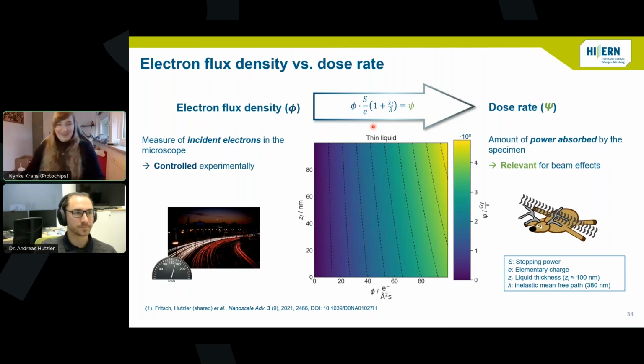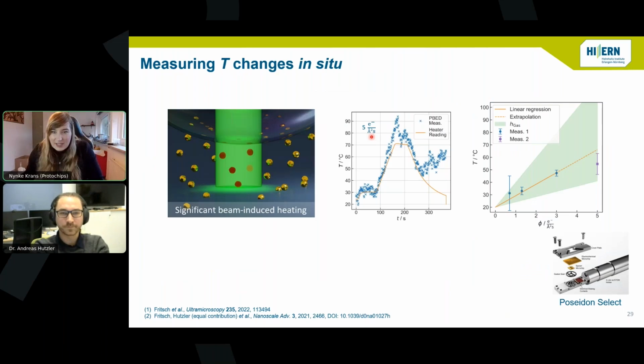That's very clear. Okay, thank you. Let me see, I'm going to grab a couple more. There's a couple of questions about the temperature studies that you've done as well. I think these were slides 29 and 30, or maybe at least 29. So in 29, the question was, what microscope alignment exactly is involved for temperature measurement?